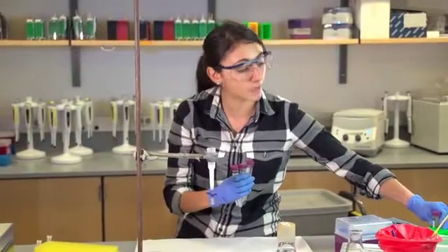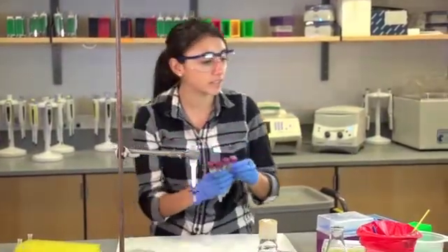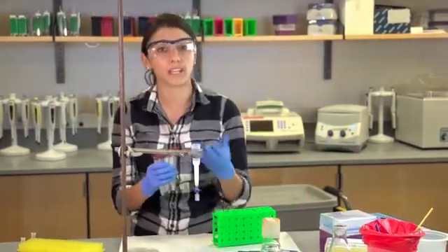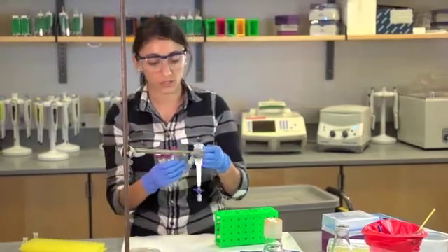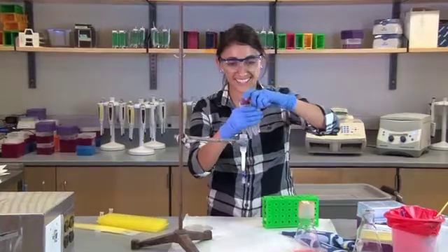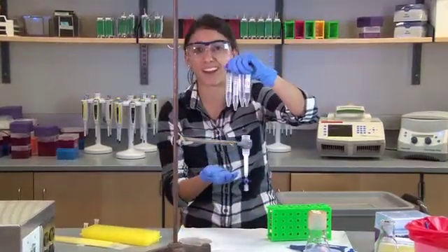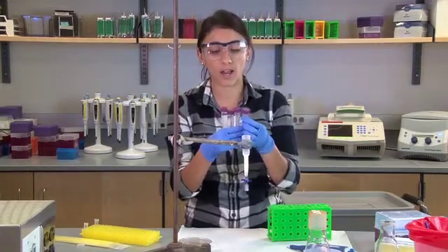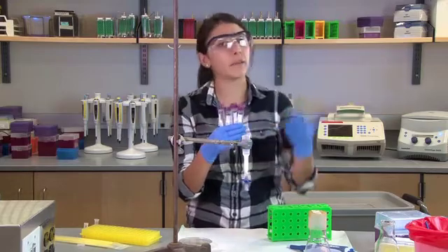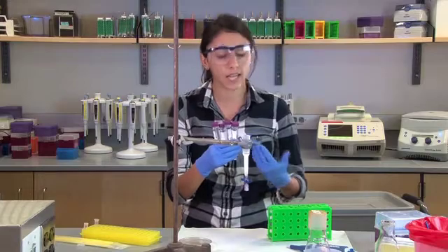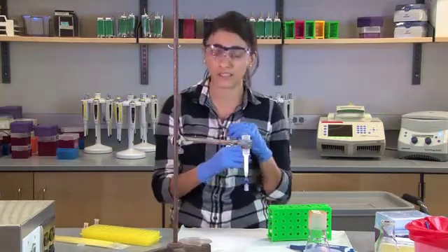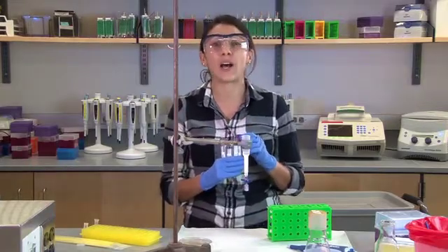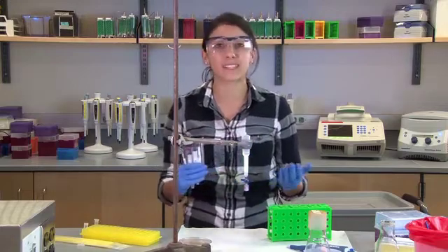The other common mistake that we see, and I am guilty for doing this, is messing up the order in which the buffers are placed in the columns. So as you can see right here, these are my four buffers and they all look the same. They all are transparent solutions. So there's no physical difference between these four besides the label. Even with the label, it gets really confusing for teachers and students alike because we're just using some letters. So we have BB, WB, EB, and CEB. And previously, students saw LYB for lysis buffer. So there are lots of Bs, lots of buffers.